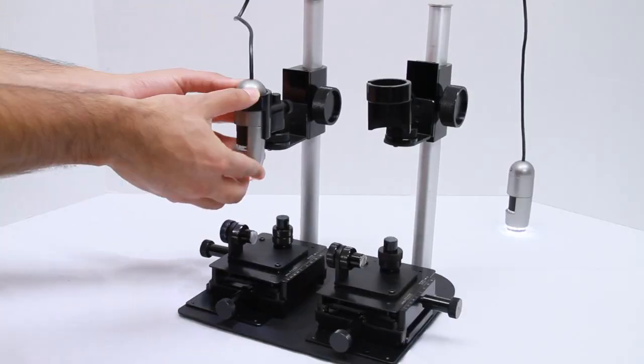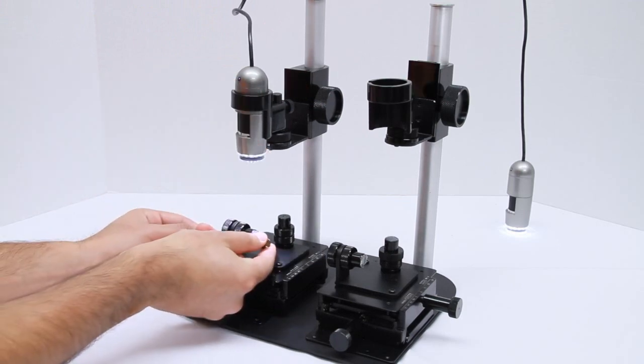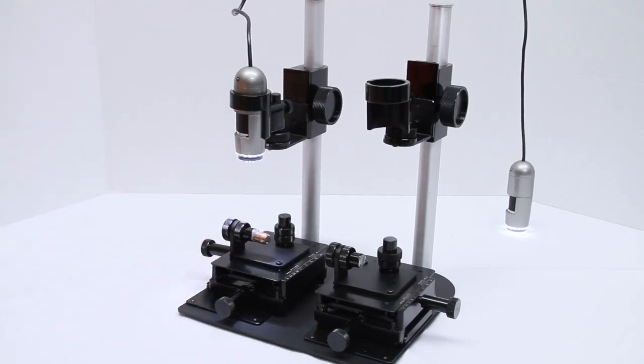After securing the Dynolite into each holster, you can place your subject, in this case a bullet secured with wax, onto the rotation stage.